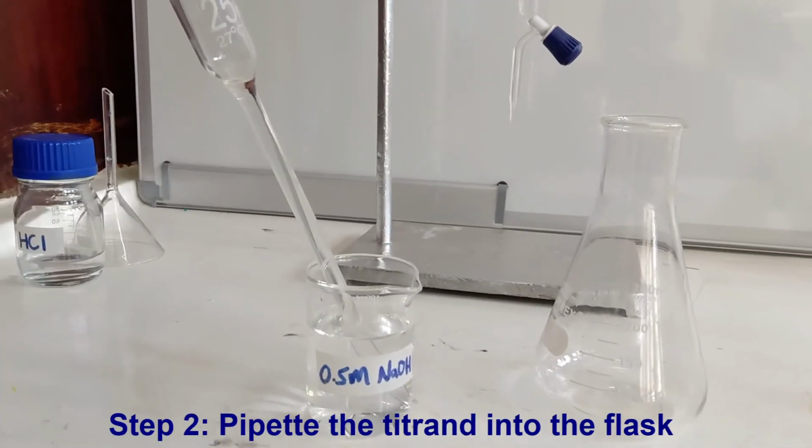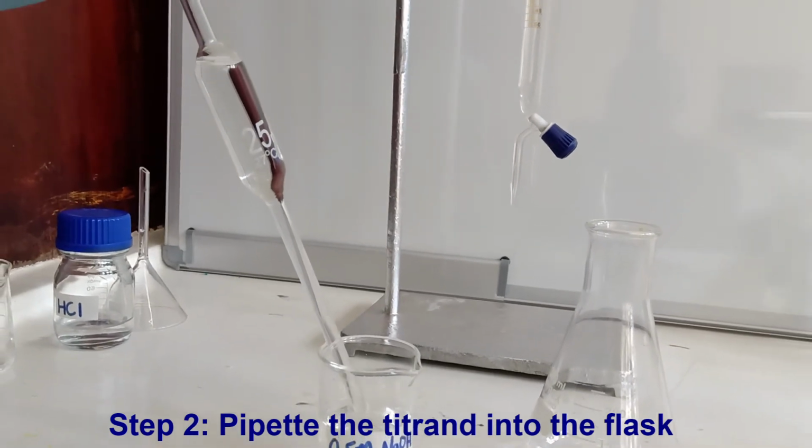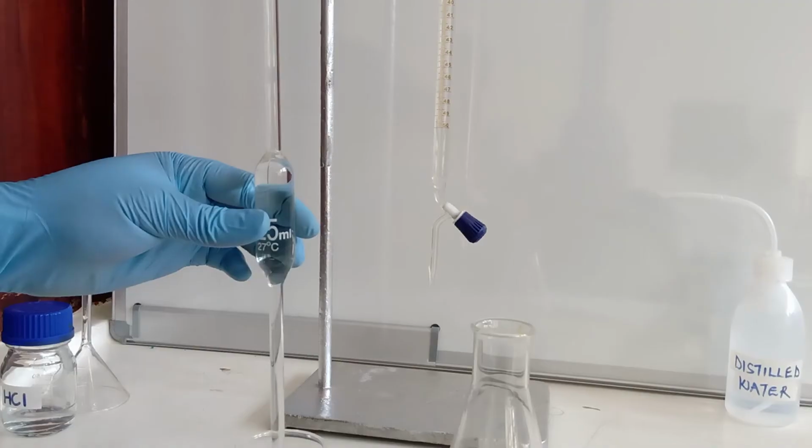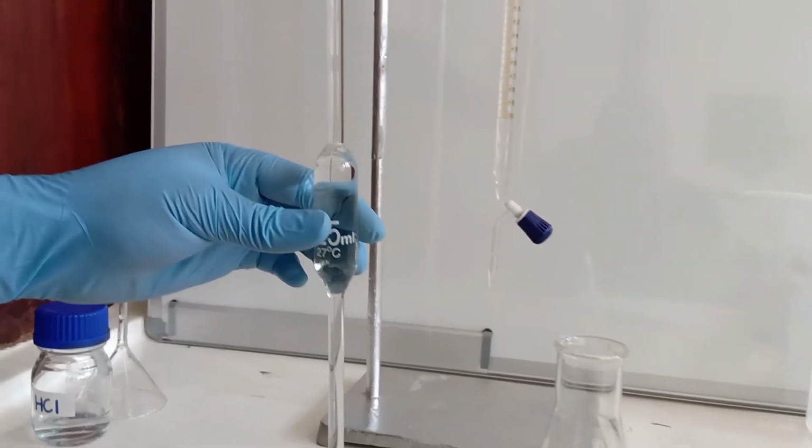After filling the burette, use a pipette to withdraw and measure the titrand. Remember, the bottom of the meniscus should touch the volume mark of the pipette. And record the volume to 2 decimal places.